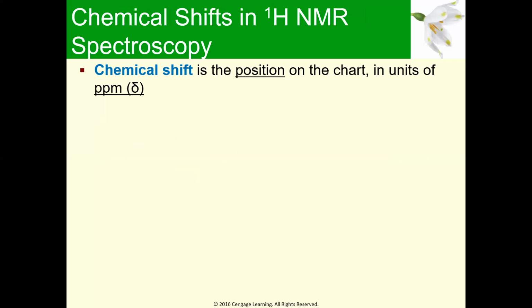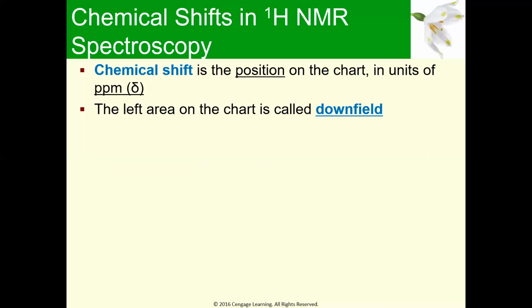Okay, so first of all, we'll focus on the chemical shift. So as I said, the chemical shift is important because of the position on the chart. First of all, what is it? It's the position on the chart, and it has units of parts per million, often given with the symbol of that lowercase Greek letter delta.